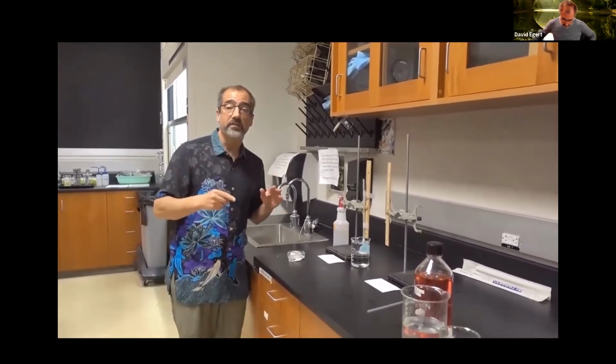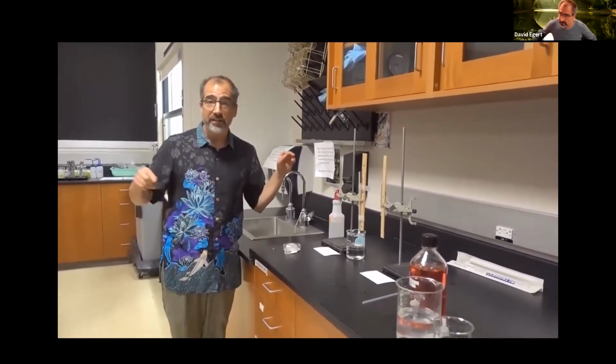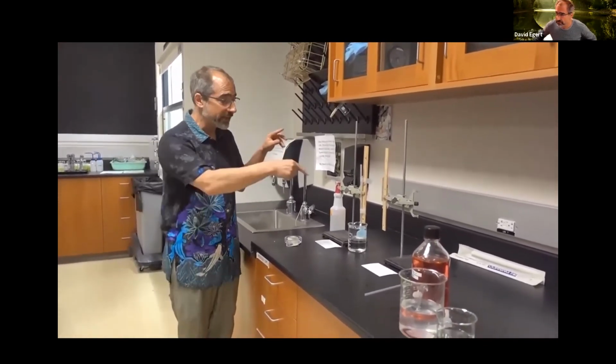While you guys go take a little break, I'm going to now set up the osmometer with the 20%.